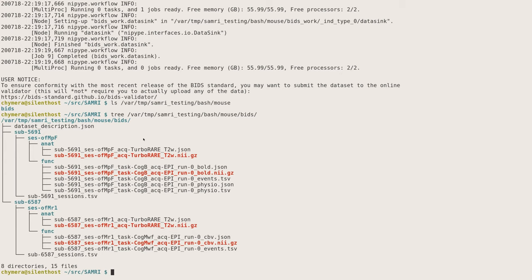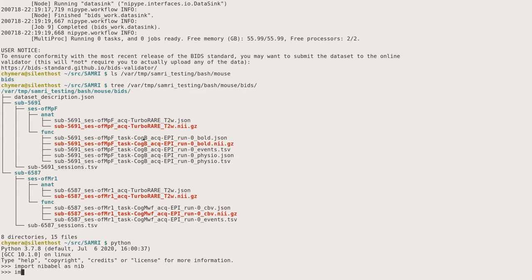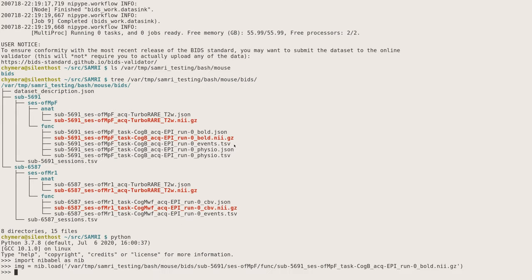In this form, it's also very accessible to a lot of Python tools. Simply if you just have the data as NIfTI, you can open it as a Python NumPy array fairly easily. You can start your Python interpreter, import Nibabel, load the image, and here you'd need the full path, which should have loaded it.